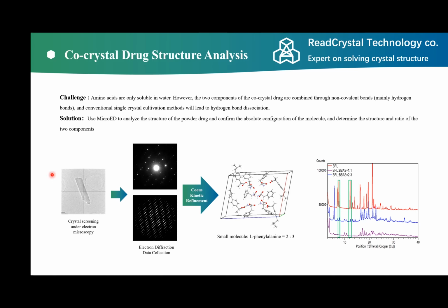But one problem with this technique is that it's hard to get a large crystal, because you don't want to change the solution for growing the co-crystal.